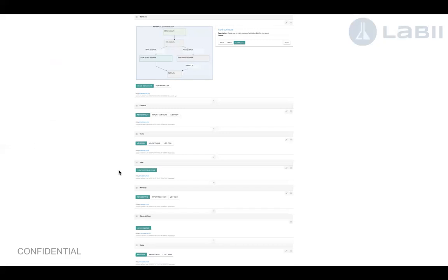This is an example. For every time a customer comes in, you need to follow some particular steps. So you can also build a workflow to see how to handle the customers. Every single step, you can follow to do something or send out an email. And then inside this detail, you can also see the contact. You can just add a contact. All the contacts associated with this account can be seen directly from here.